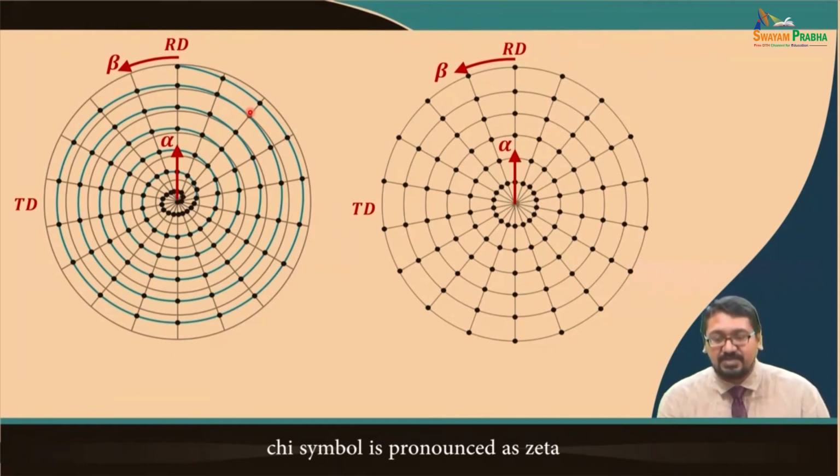But now things have changed, and with the machinery we can do a much higher resolution scan. Nowadays, initially alpha is rotated by a few degrees, and then beta is rotated from 0 to 360 degrees to get a scan, and then again alpha proceeds by 2.5 degrees or 5 degrees, and beta is rotated by 360 degrees to get another scan.